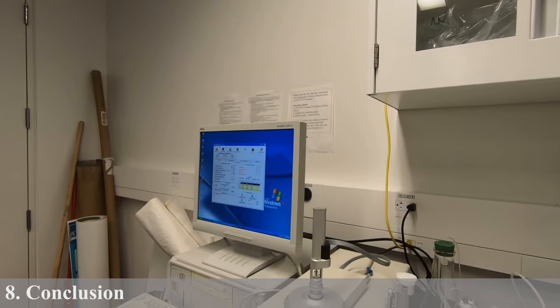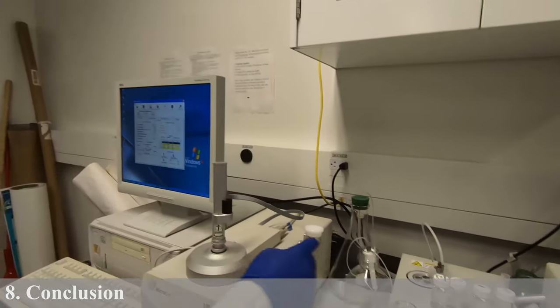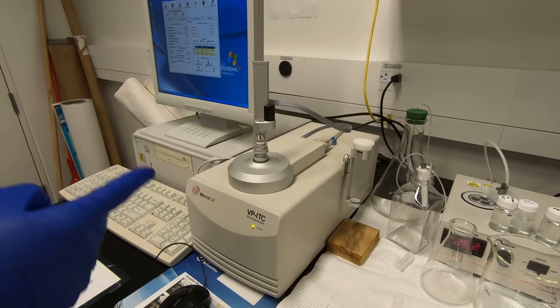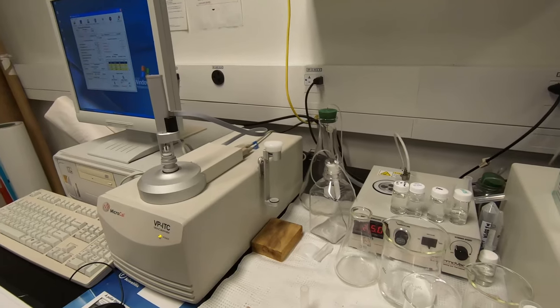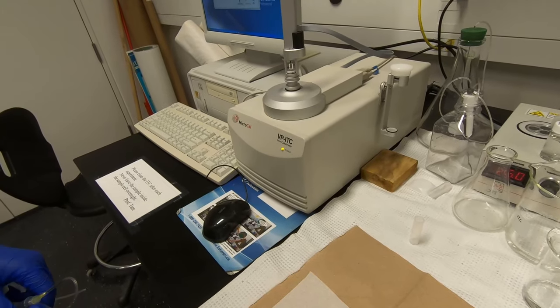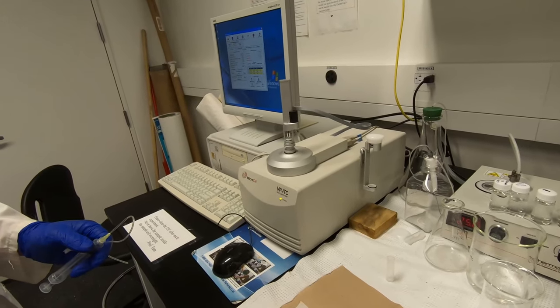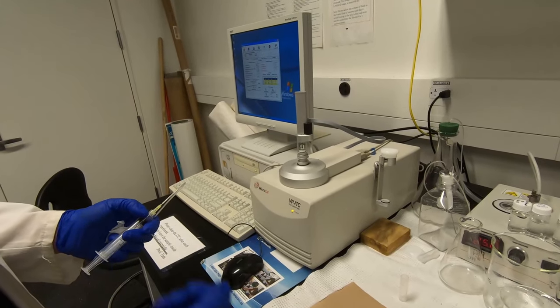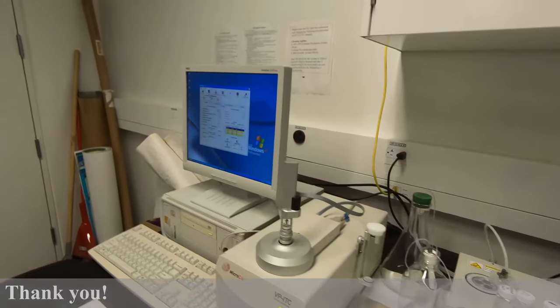After finishing one run, you need to clean the ITC using the cleaning procedure I showed earlier. You can use a chelating solution to remove metal ions. That's all for the ITC experiment — thank you.